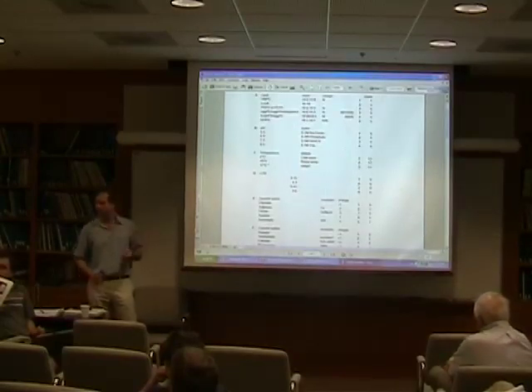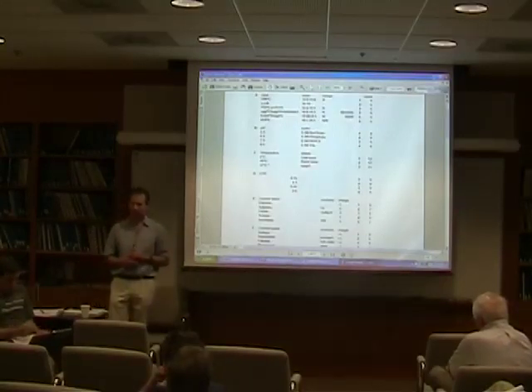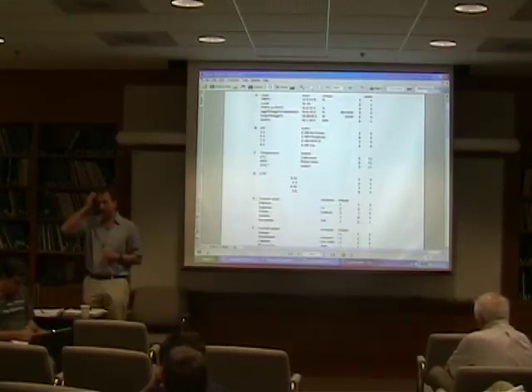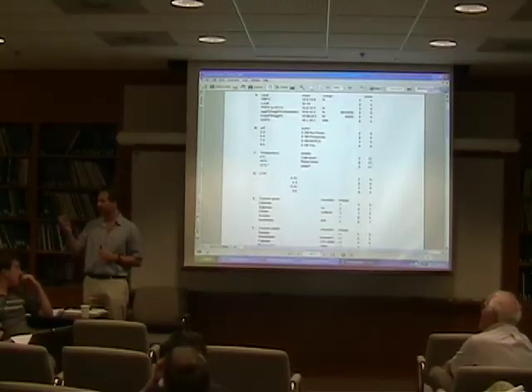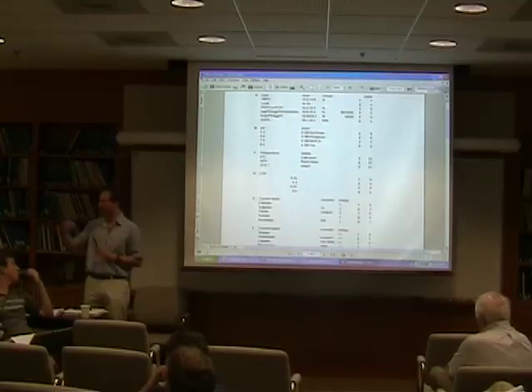But I think the very first thing to decide now is whether you want to use biobeads or dialysis, because then these things make differences. I guess it's personal preference. I think the use of biobeads allows you to put it in something like the thermocycler, so you can quickly set things up. It also allows you to try these interactions between detergents. So you actually always try to use the conditions you got with the biobeads and reproduce them with dialysis? Absolutely. Yeah, that would be the second phase.